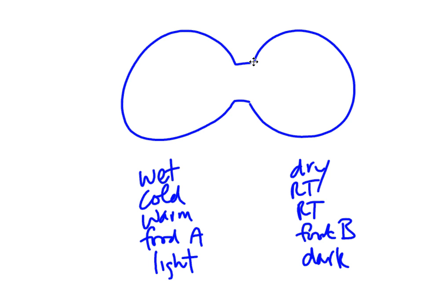So what you'll do initially is you'll put five. We're gonna go with 10 pill bugs. Stick with 10, right? There's 10 pill bugs. You're gonna put five in one container, or five on one side and five on the other, and then every 30 seconds for 10 minutes, you're going to count the pill bugs on each side.